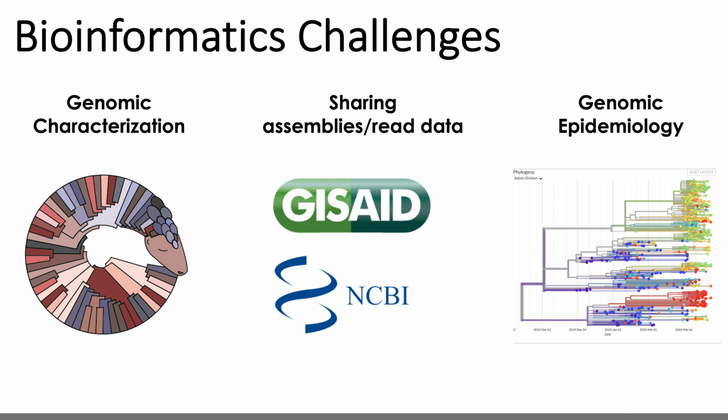First off, it's important to frame this talk with the major bioinformatics challenges that public health labs are facing with regards to analyzing SARS-CoV-2 genomes. More labs now than ever have the capabilities of sequencing SARS-CoV-2 samples, but there are still major barriers to analysis. And I think broadly, these challenges can be categorized as genomic characterization, and I tend to define this as the assembly and characterization of single samples by clade and lineage type. This is, of course, a major requisite for our ability to track and understand the spread of variants of concerns.